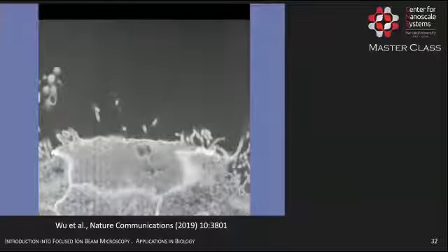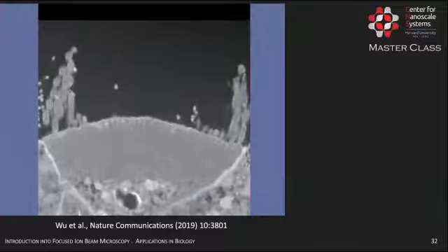So he was able now to do this and prepare a 3-dimensional, do this in 3D. And this last serial section run that you see here is built in 3 segments. First, you see again all the secondary backscatter images going through the hair cell. Then the video turns around, and you start to see how the relevant cilia are marked. And then in the third run, you will see how the three-dimensional object is evolving.